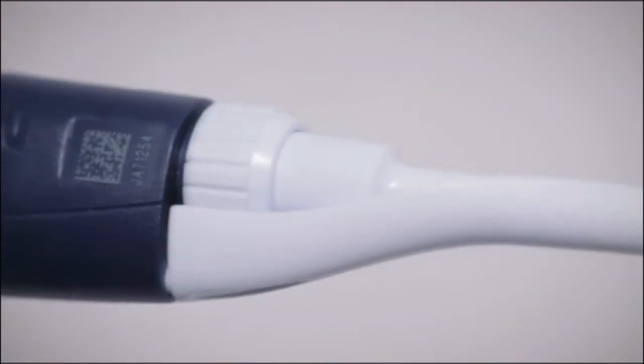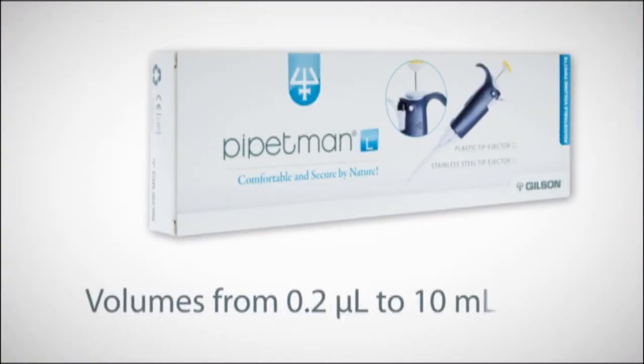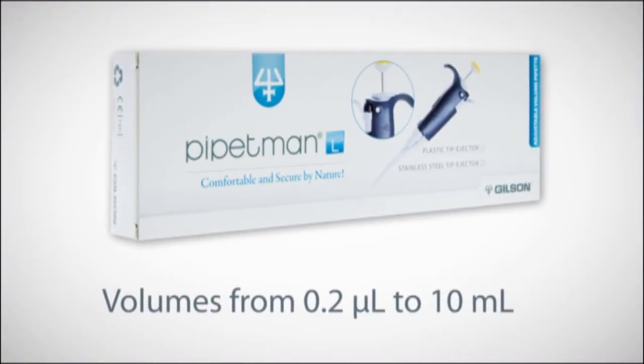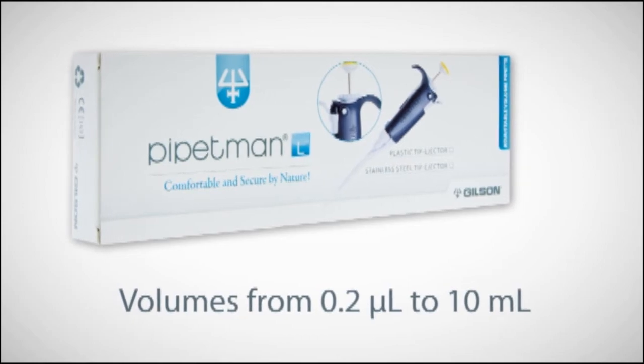The Pipet-Man L is available in eight models. You can either choose a pipette with a plastic or metal ejector.